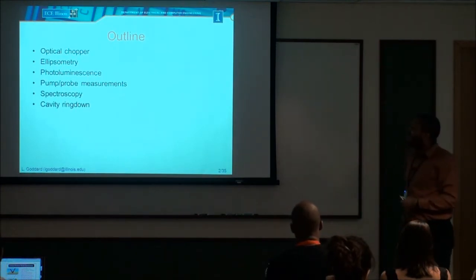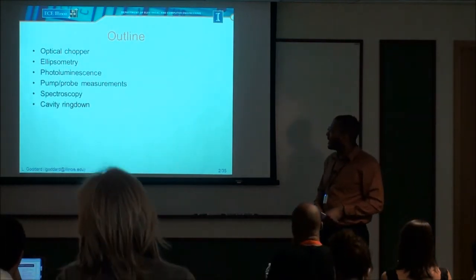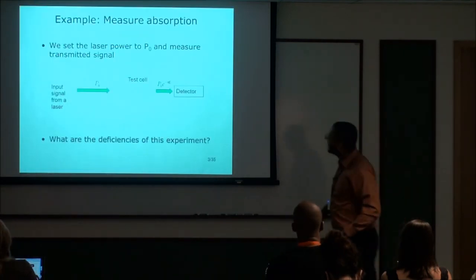Okay, so I'll be talking about ellipsometry, photoluminescence, and then some other advanced methods in pump probe spectroscopy and cavity ring down. So first, oh wow, it didn't show up.